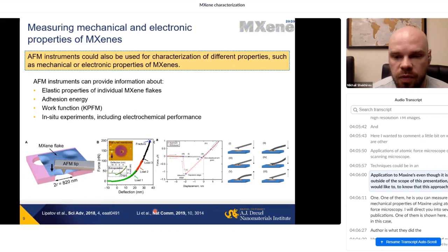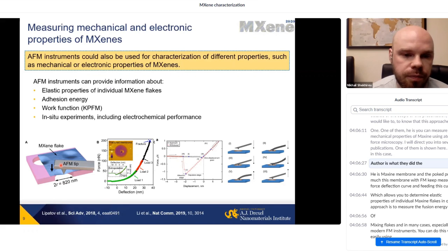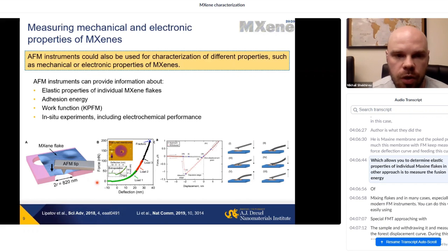Even though it is outside of the scope of this presentation, I would like you to know that these approaches exist. One of them is that you can measure mechanical properties of MXene using atomic force microscopy. I will direct you to several publications. One of them is shown here. In this case, the authors used an MXene membrane and poked this membrane with an AFM tip, measuring the force deflection curve and fitting this curve, which allows you to determine elastic properties of individual MXene flakes.